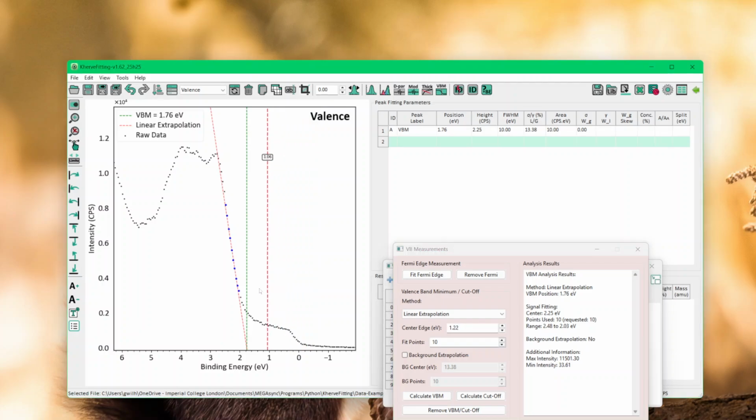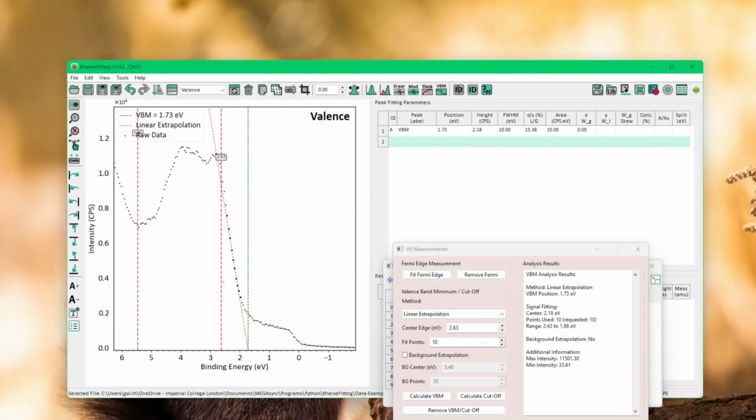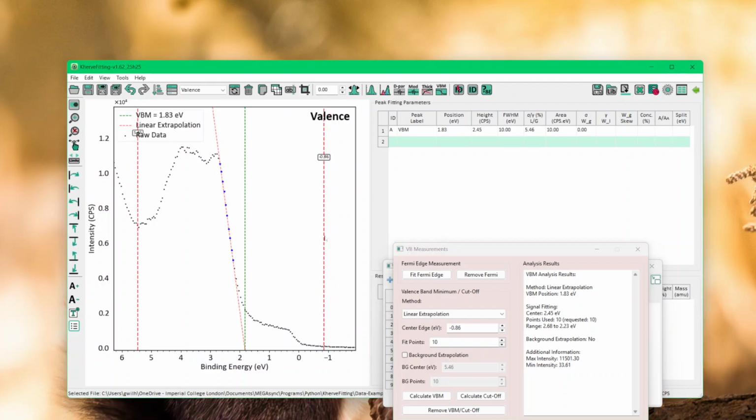So let's say actually I wanted it somewhere here. You just redo, and now actually it's the same thing. Let's continue one more time, and maybe put it somewhere there, and you can see now it's changed quite a bit. So it's up to you to do what you want, but I would consider to actually use the background.